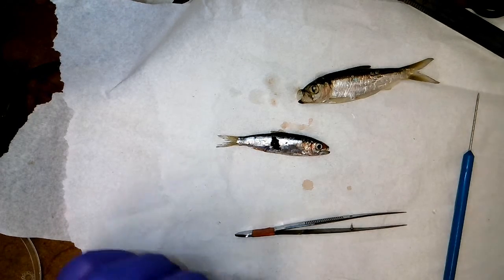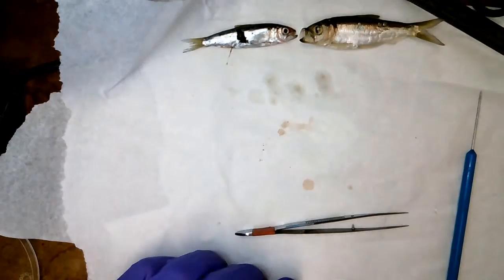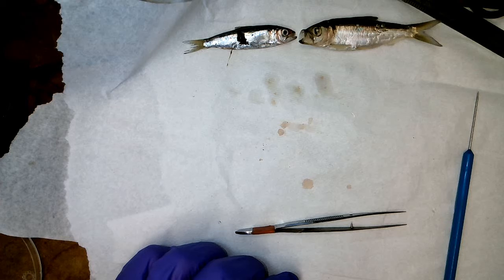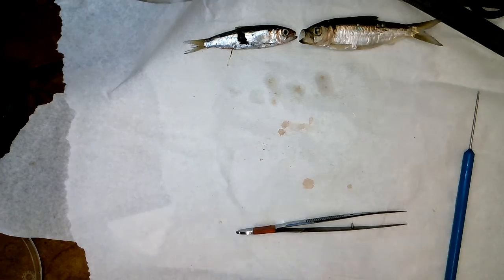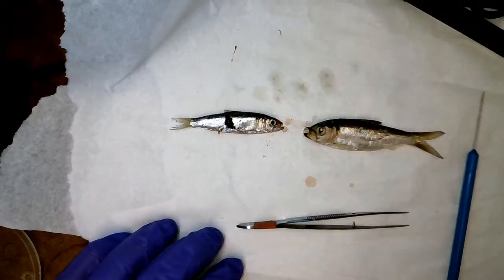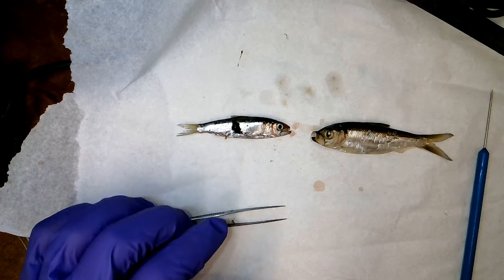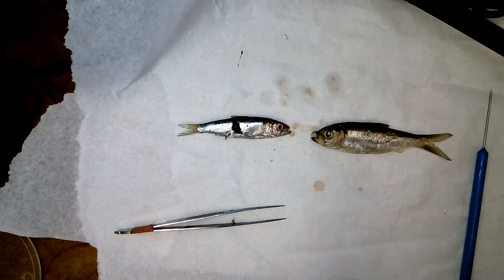Okay, let's stop for a minute and pull up what we're calling the Devine herring ID sheet. So this is the one with all the different measurements A to F that we were discussing. It might be worthwhile to just review some of those quickly with folks. If you remember, A, we're looking at the snout. We're making a measurement from the snout to the center of the eye.